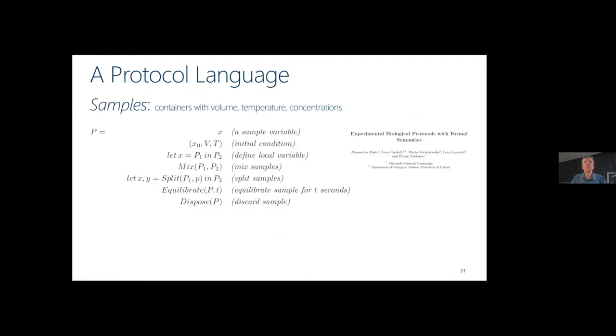So how do we program these protocols? Well, basically you need to codify. There are many proprietary protocol languages. Each kind of automated piece of lab equipment comes basically with its own little protocol language of some form or another. So here I'm describing very abstract ones. It comes from this paper here.